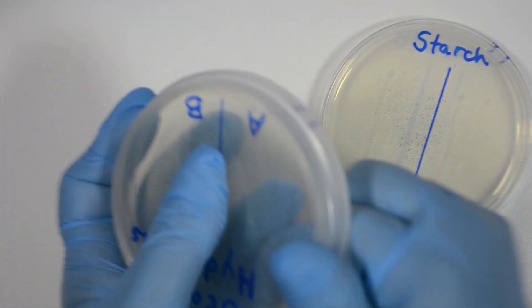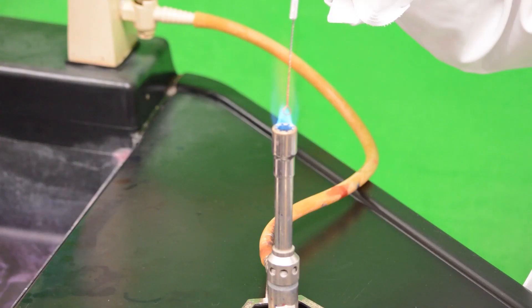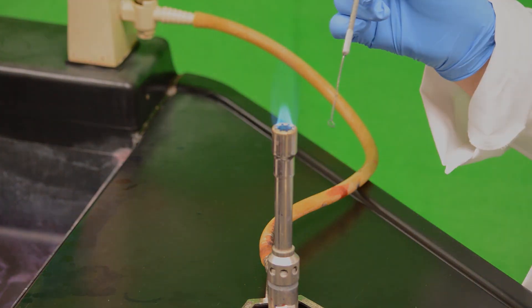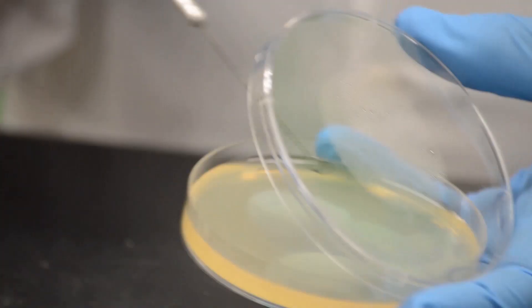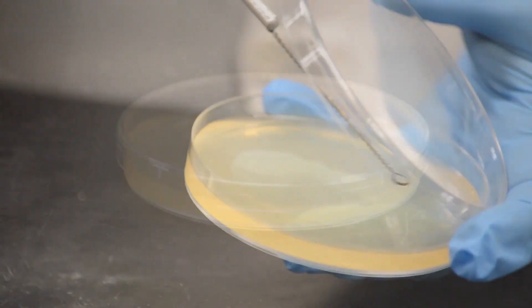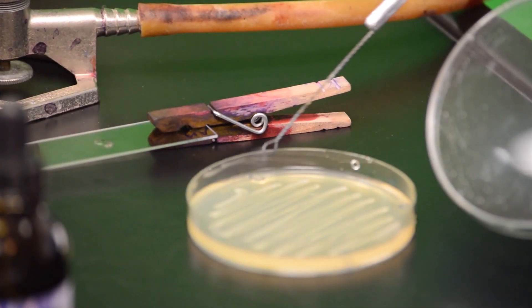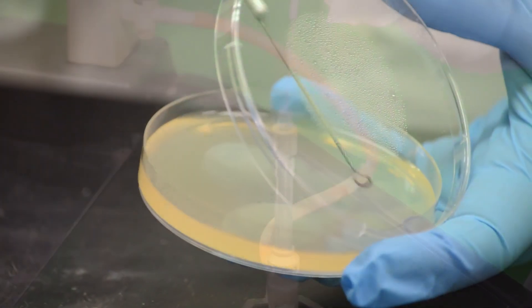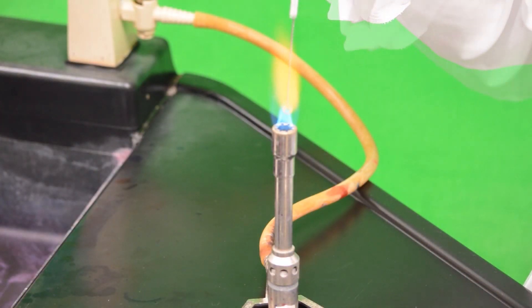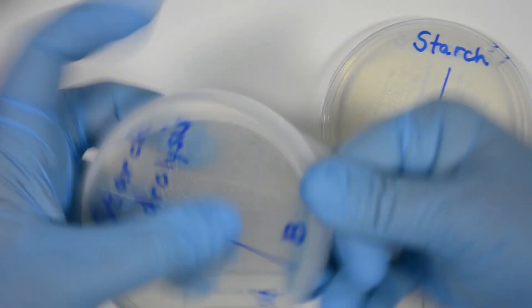If you were using sterilized loops, we would do the same procedure as before. First, flame the loop and let it cool down. Pick up a small amount of one sample, then streak it on the medium making a straight line. Flame the loop again, let it cool down, pick up a small amount of the other bacterial sample, then streak it on the medium. Flame the loop again and let it cool down. The loop can now be stored and the plate sealed with parafilm.